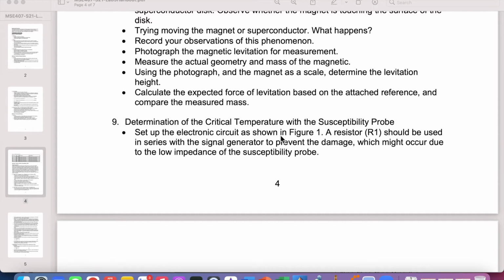That's one of the many things that we can get out of this measurement, but the most critical portion of this is the critical temperature, TC. That's what we want to get out of this measurement for our pellets, and what conditions from the procedure that we did may affect the critical temperature. So that's what we're going to do with these calculations: we're going to try to get the critical temperature, and we're also going to see what other kind of information we can get.